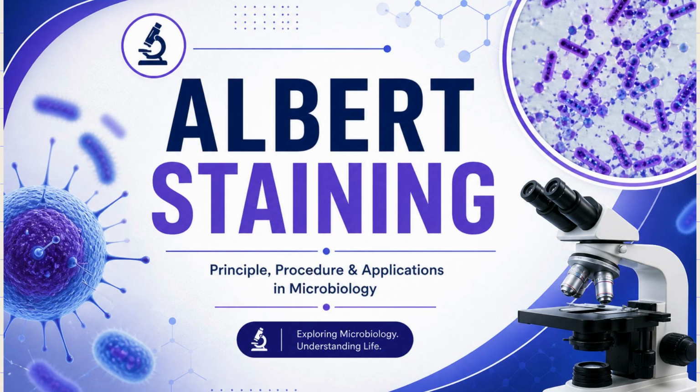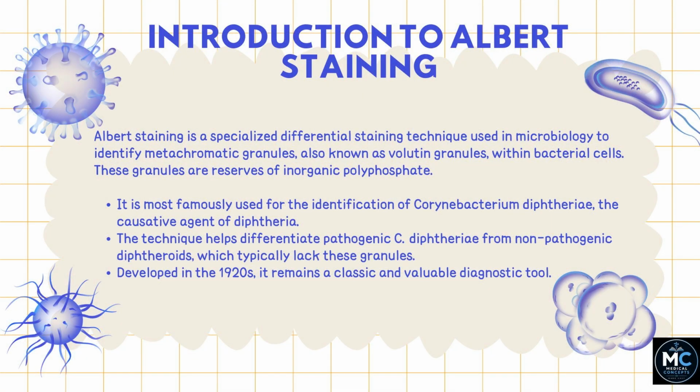Let's get started. Albert staining is a specialized differential staining technique used in microbiology. It is mainly used for identifying metachromatic granules inside bacterial cells. These granules are made of inorganic polyphosphate and act as storage material. The technique is especially important for identifying Corynebacterium diphtheriae, the organism responsible for diphtheria. It also helps differentiate pathogenic bacteria from non-pathogenic diphtheroids.